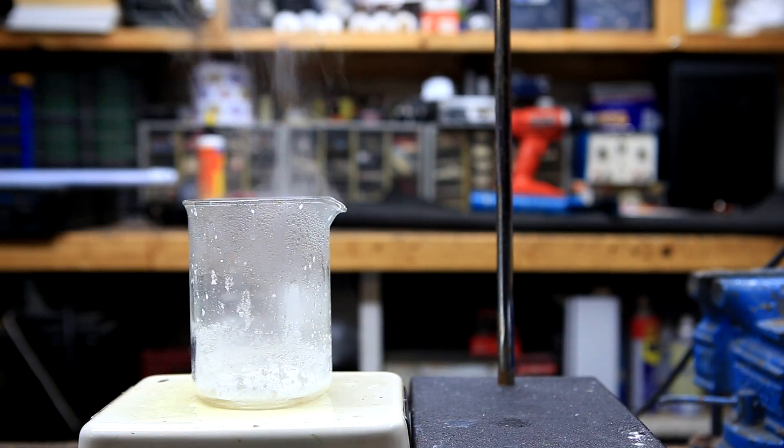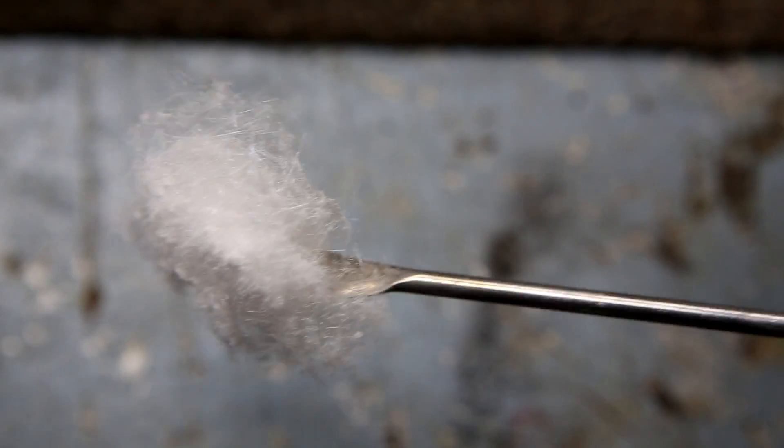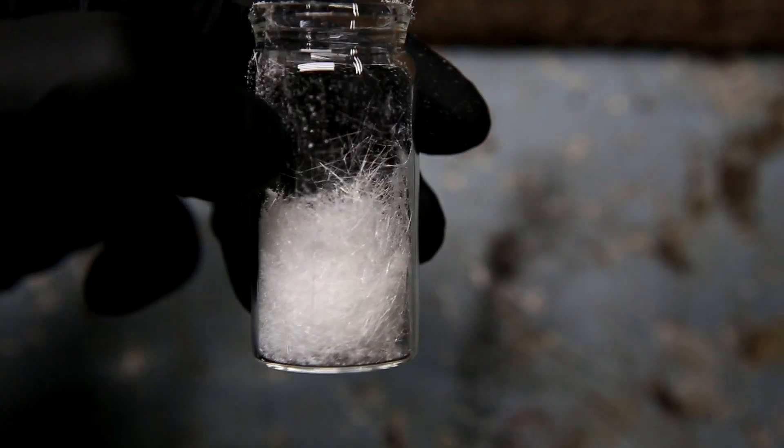Phthalic anhydride is an extremely useful organic molecule and in a future video I'll use it to make phenolphthalein. Also, over the course of several videos I'll convert it to phthalimide, then to anthranilic acid and finally to methylanthranylate. Methylanthranylate is an imitation grape flavor that's used in lots of different candies and foods and it's used as the main flavor additive in grape Kool-Aid.